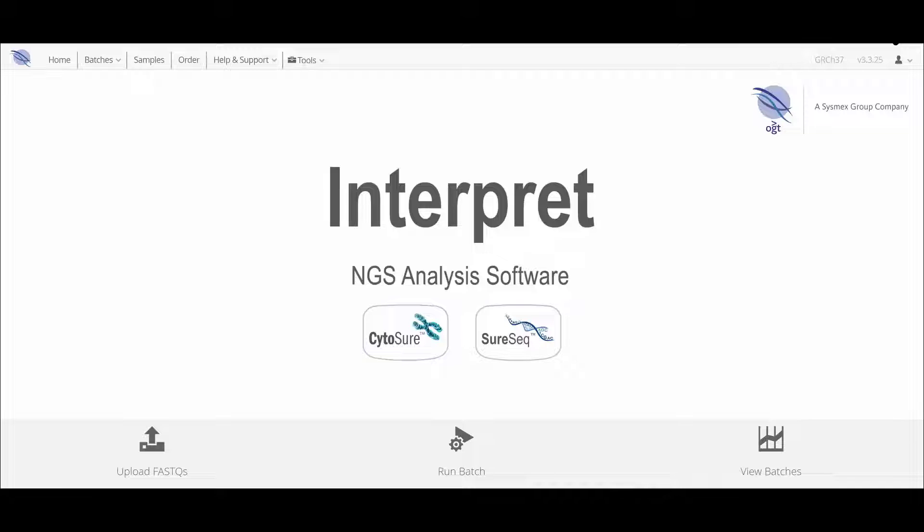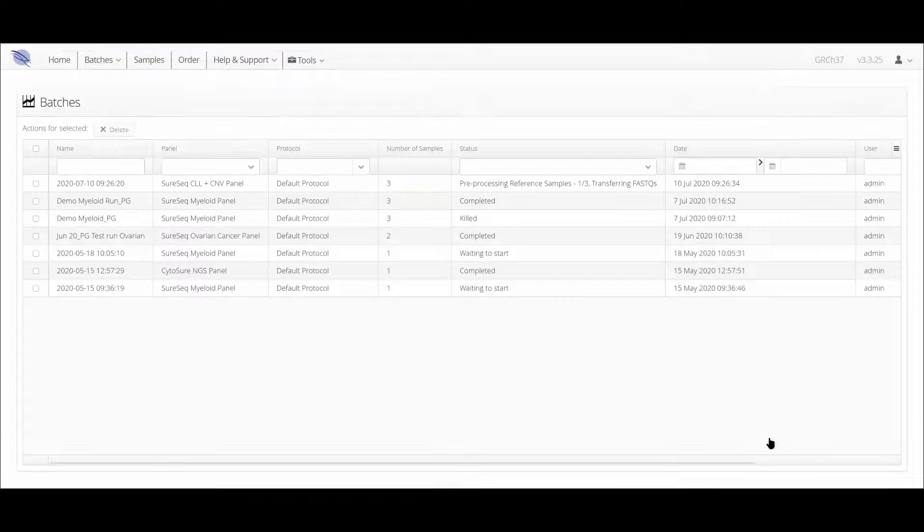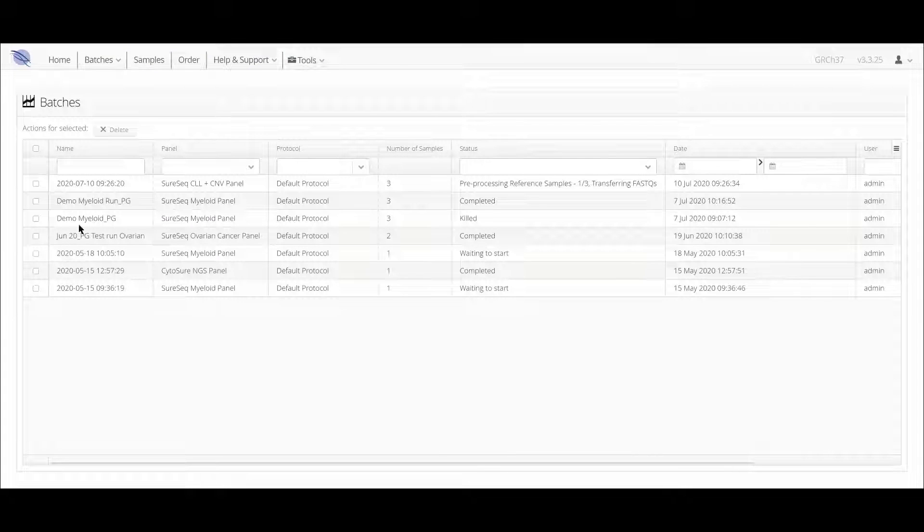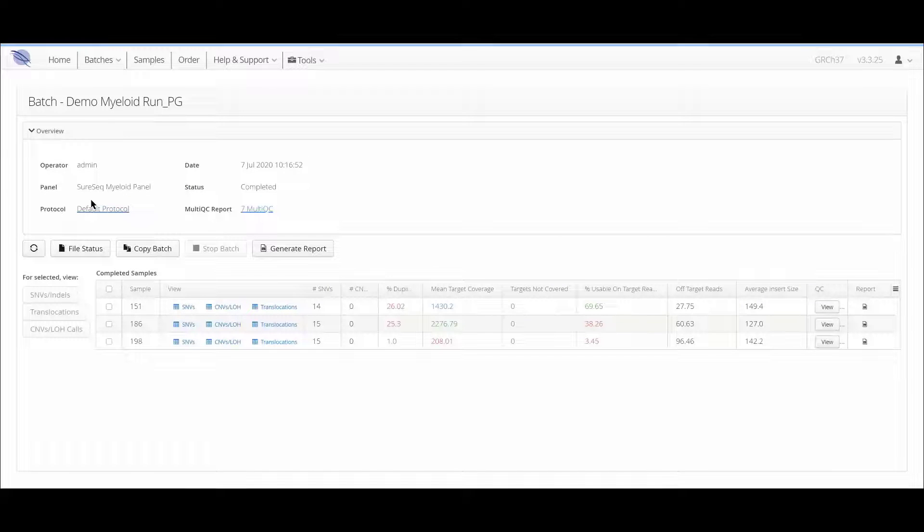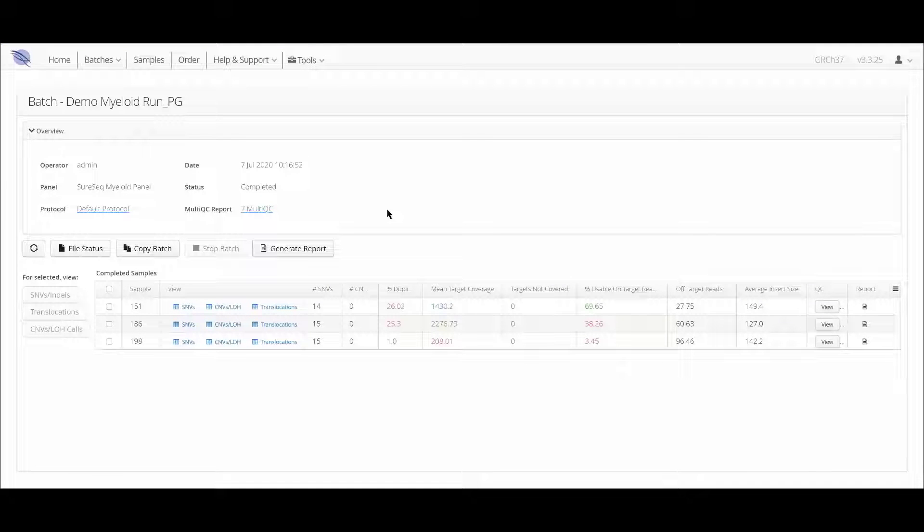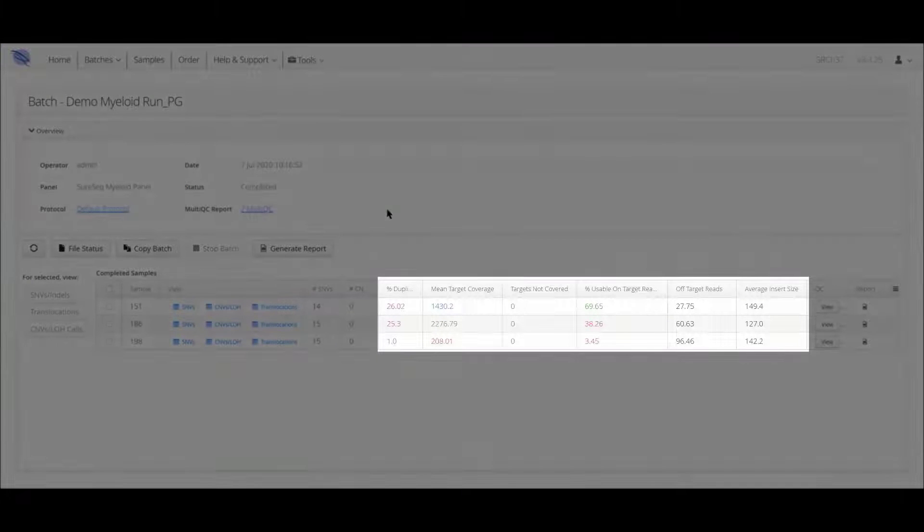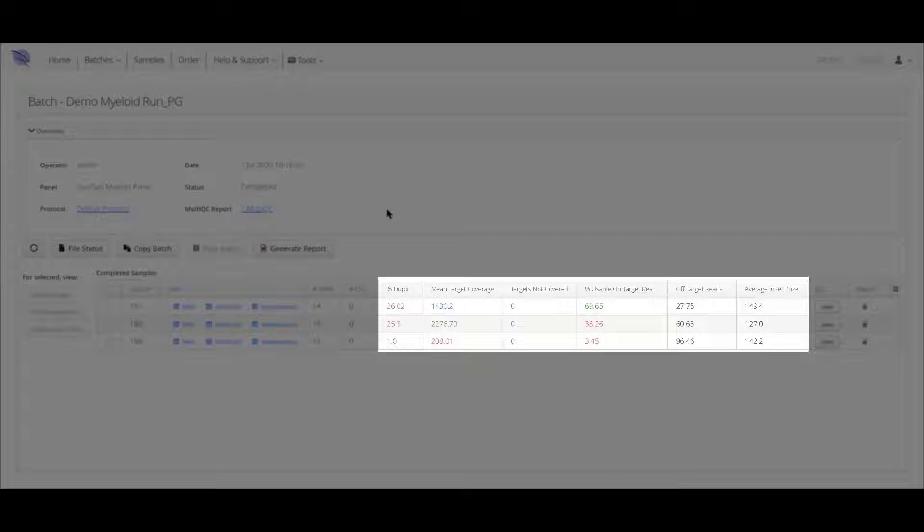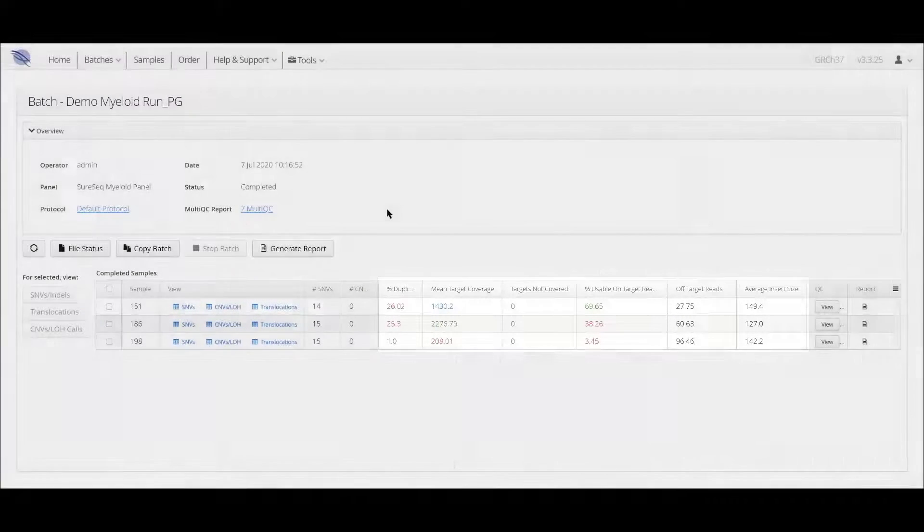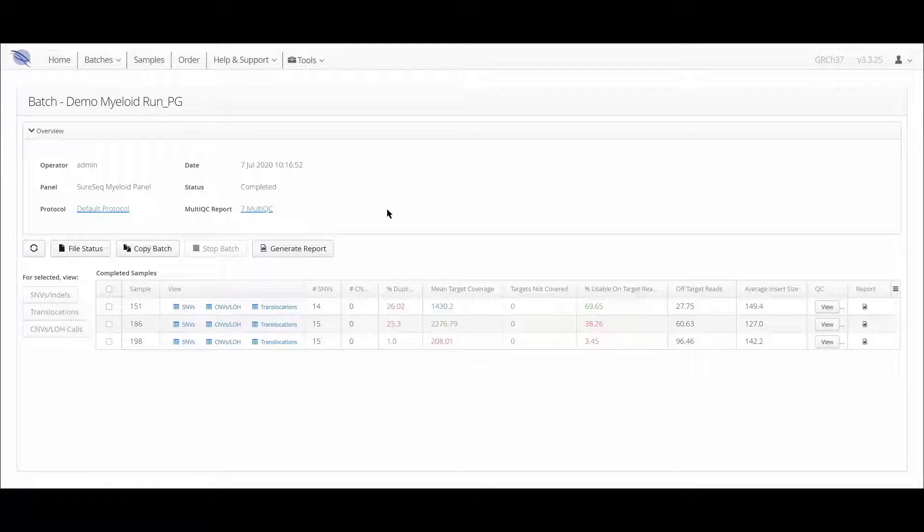The QC data from your run can be accessed on the Batch page. Firstly, in the Batch Summary table, you will see a set of values for each sample and these will be color-coded to indicate high, medium, and low quality data according to the metric set assigned in the analysis protocol.